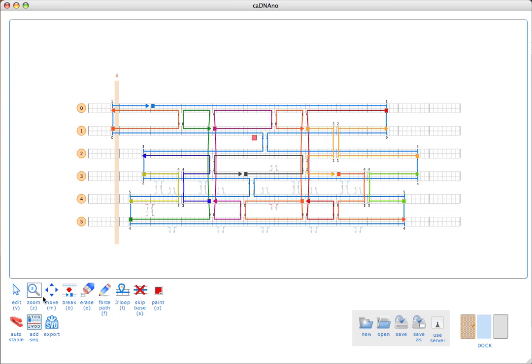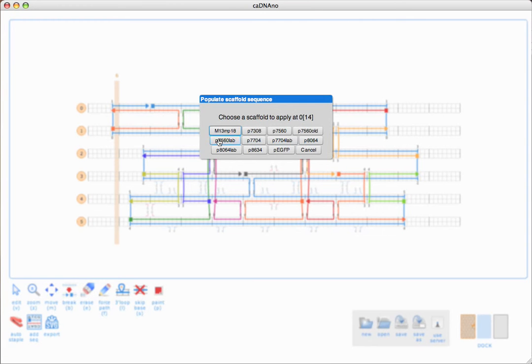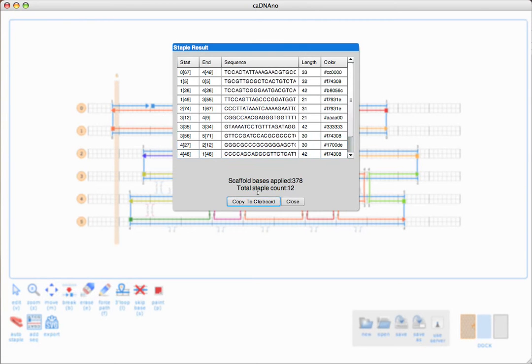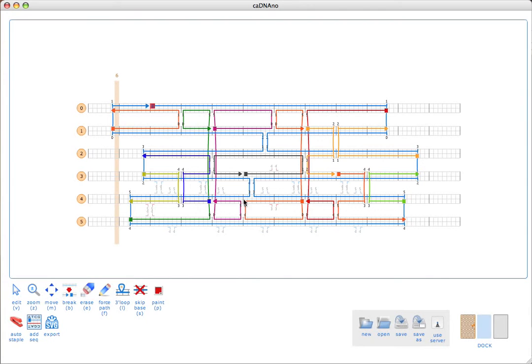Now I'll just regenerate that staple list — click there, use the same scaffold. Now all of our sequences look good and I don't see any question marks. So we can just copy this to the clipboard and then work with our spreadsheet program.